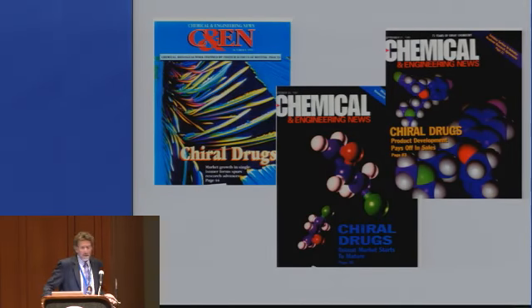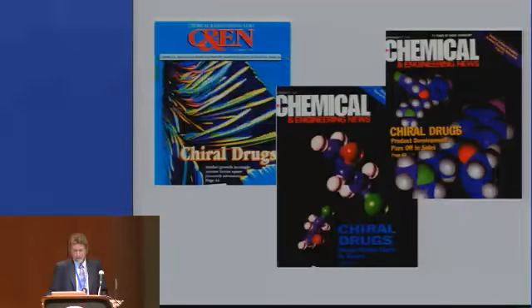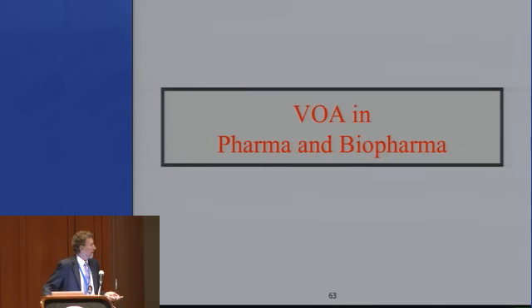These C&EN News articles are really what allowed Rina to convince BOMEM to build the VCD for the first time, because we just did a market study on the fact that chiral drugs were going to become important, single enantiomers were going to become important. You had to prove absolute configuration, and BOMEM luckily saw the prospects of doing that and agreed to help Rina and I to go ahead and start BioTools and start commercial VCD.